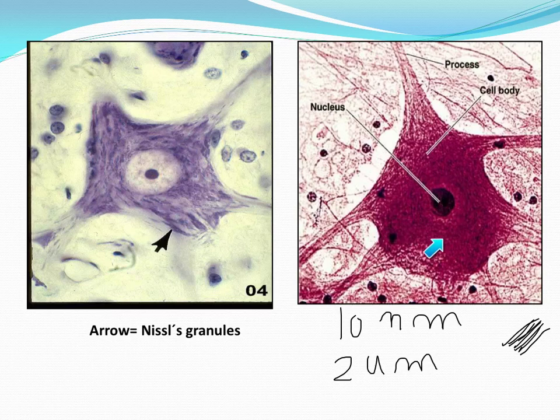They are called neurofibrils now because they are evident by the light microscope, so they are accumulated neurofilaments. What is the function? The function is support. Another important thing, they are present in the body and in all processes, either dendrites or axon. In all processes, these neurofibrils are present for structural support.